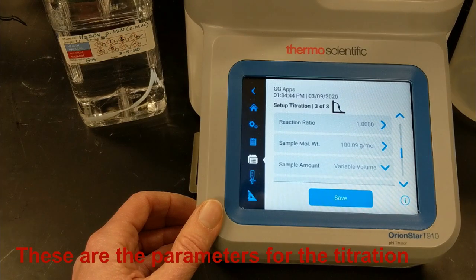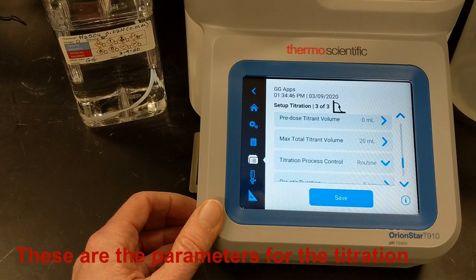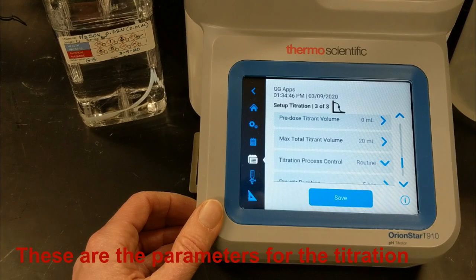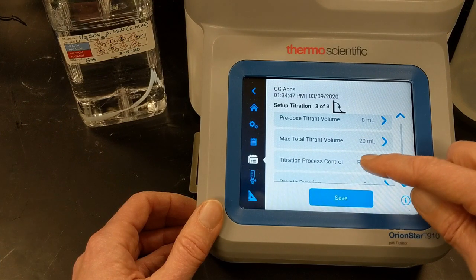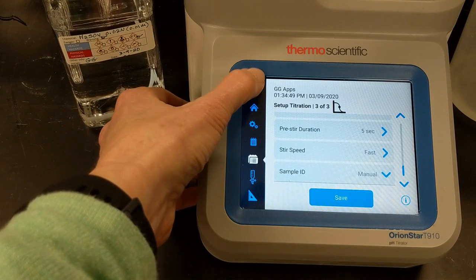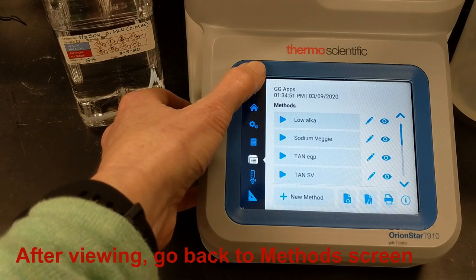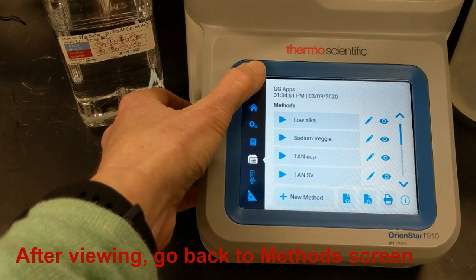The molecular weight of calcium carbonate is 100.09. The sample amount will be a variable volume, generally between 100 and 200 mL. The predose is 0 mL. The max titrant volume is set to 20 mL. A routine process control is used, with a 5-second pre-stir, fast stir speed, and manual sample ID to allow me to name my samples. After viewing, I navigate back to the edit method screen and then the method screen.